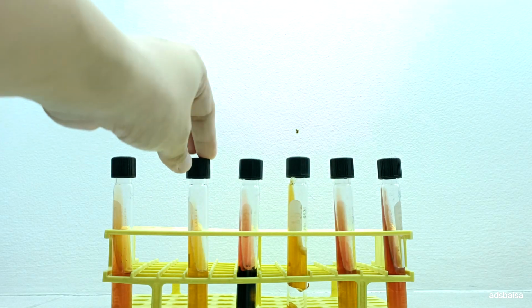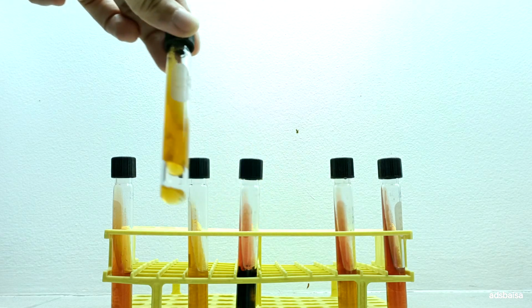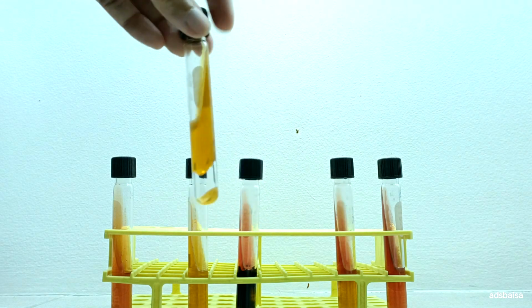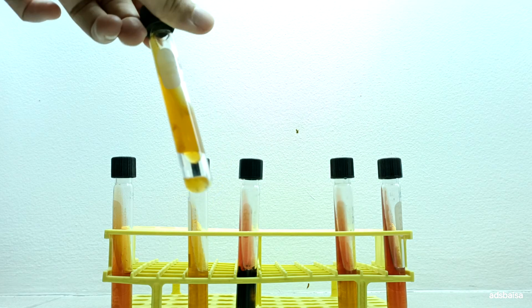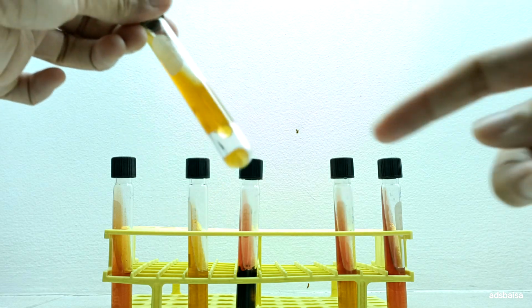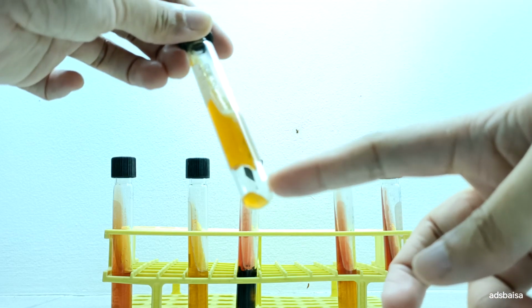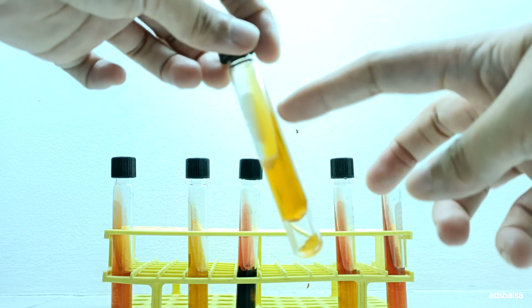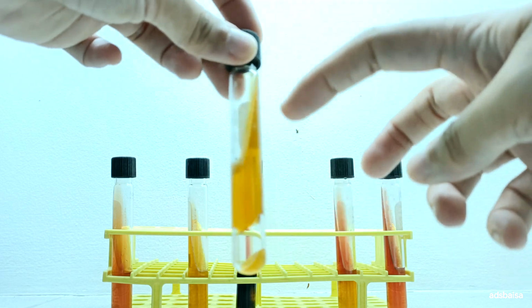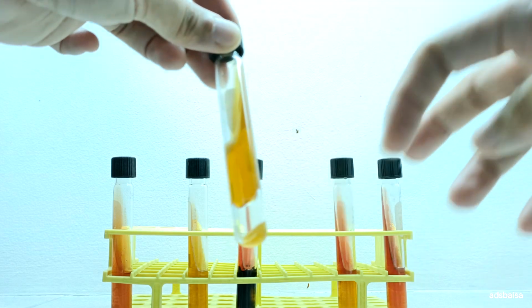Next we have gas formation. So this is also A over A. The slant and butt are both acid, that's why A over A. But as you can notice, there is splitting of the agar, indicating gas formation. This is written as A over Ag. G stands for gas production.